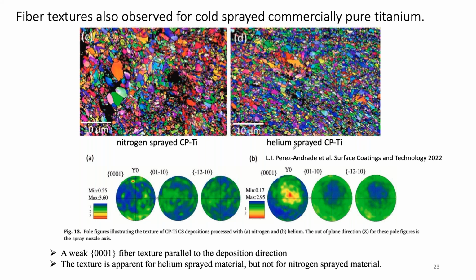We have looked at this for some other materials that we've been studying, some Inconels and steels, and you don't see texture all the time. We've seen it in that aluminum case, and we saw it in titanium, but that's probably a thread that deserves further pulling.